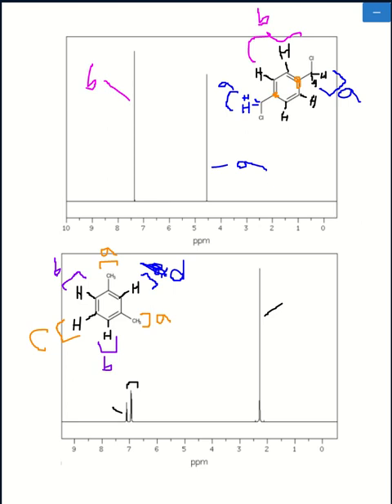Well, right from the start, the only hydrogen environments that are not connected to the benzene ring are the methyl groups. Well, or are the hydrogen connected to a carbon that is then connected to the ring. Those methyl group hydrogen, which are labeled A, well, methyl groups, they show up quite upfield, quite far to the right. And there's only one peak to the right.